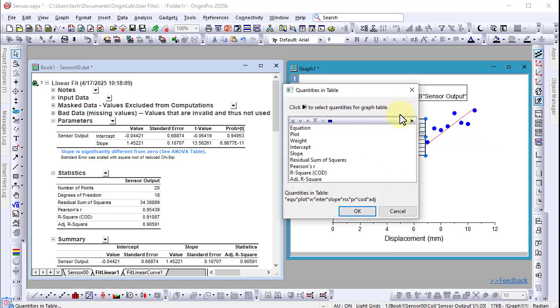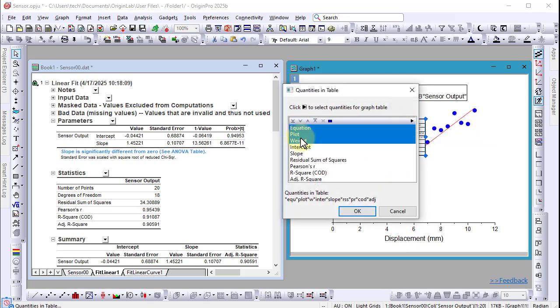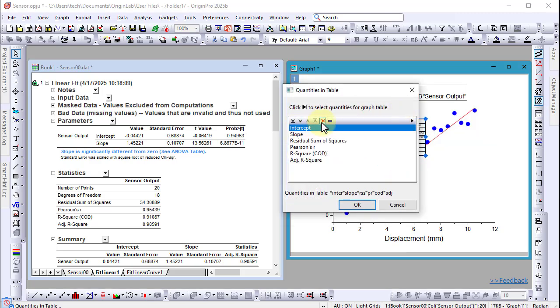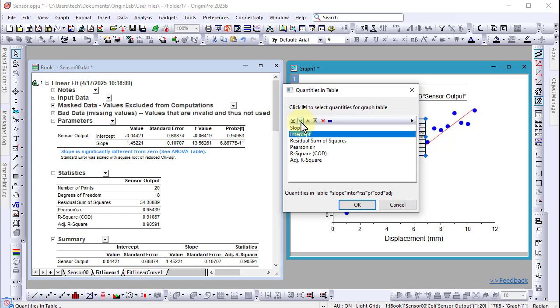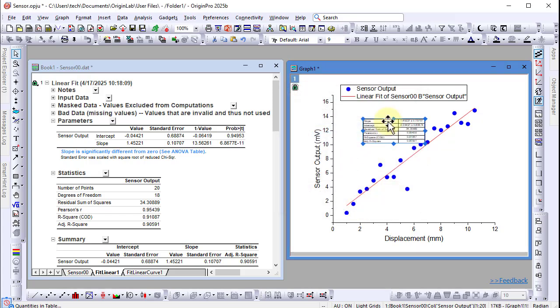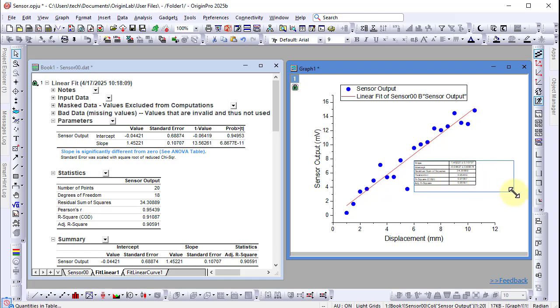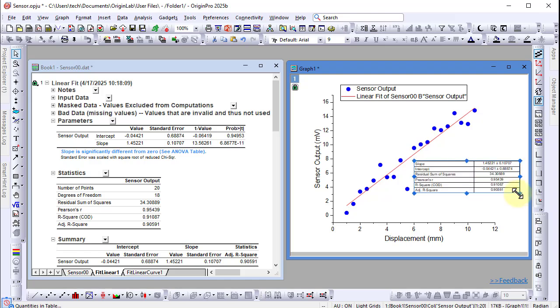Using the mini toolbar, I can change the quantities that appear in this table, change the order in which they appear, and customize the appearance of the table itself.